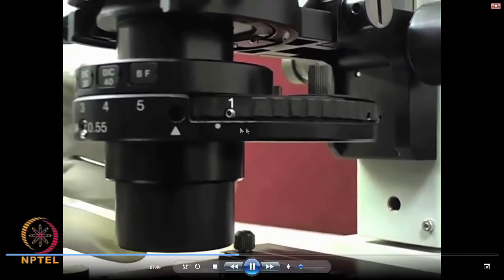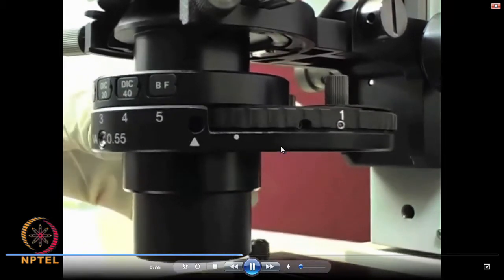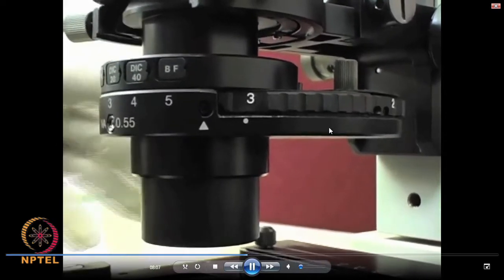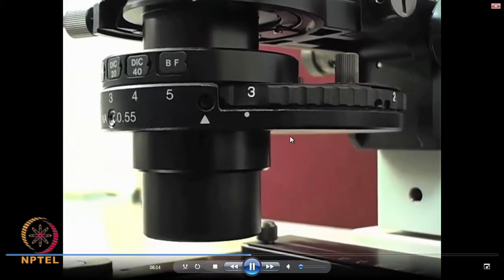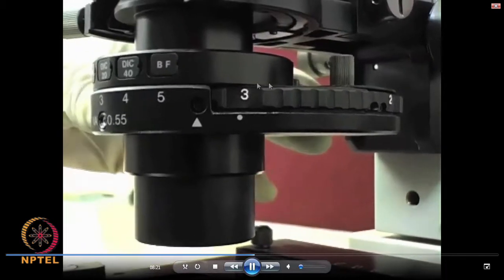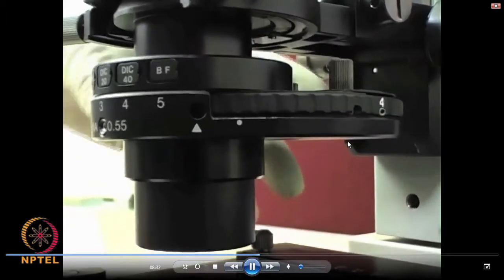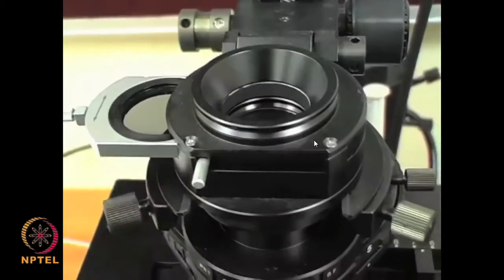So this is, for your clarity, a much closer view of the condenser apertures being rotated: 1, 2 for phase contrast mode, 3 for DIC mode. I will let you know the details of what kind of apertures and condenser details as and when I talk about the theory of this mode of operation. I just want to introduce the kind of hardware you should know. You should not think that every microscope variant will have a different microscope as a whole. It is just the aperture, condenser setup and filters which make the variants of the microscopy.